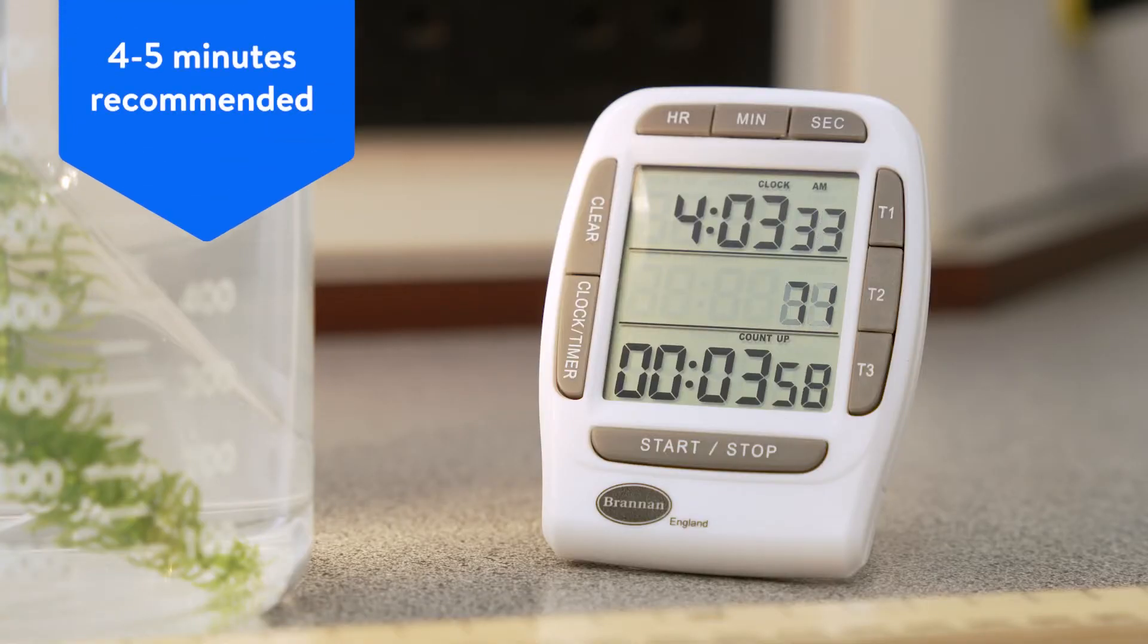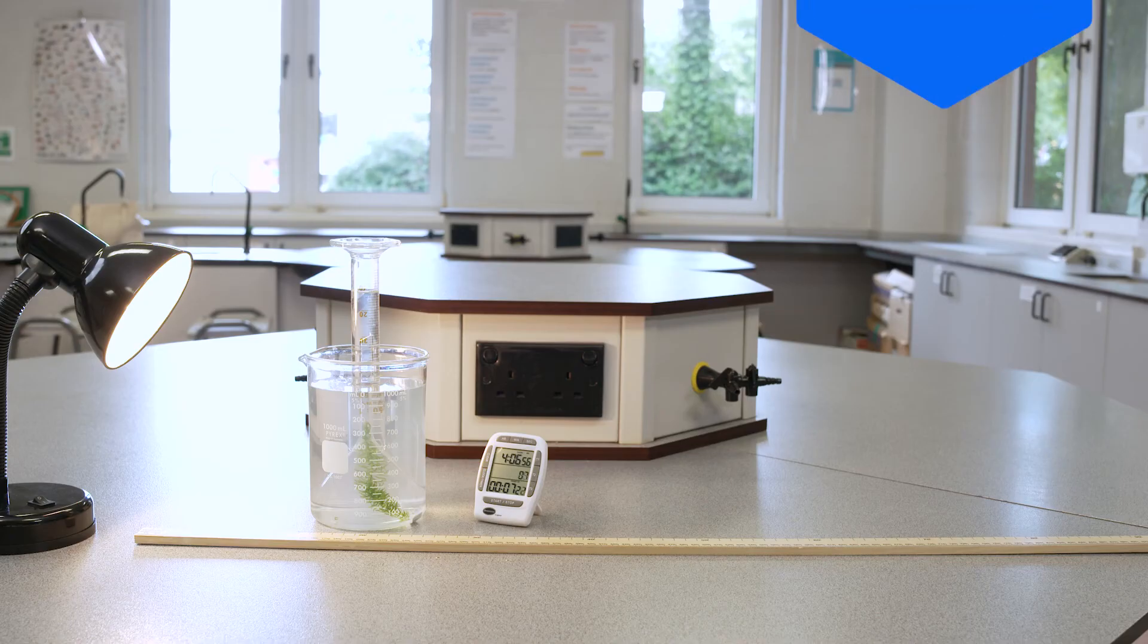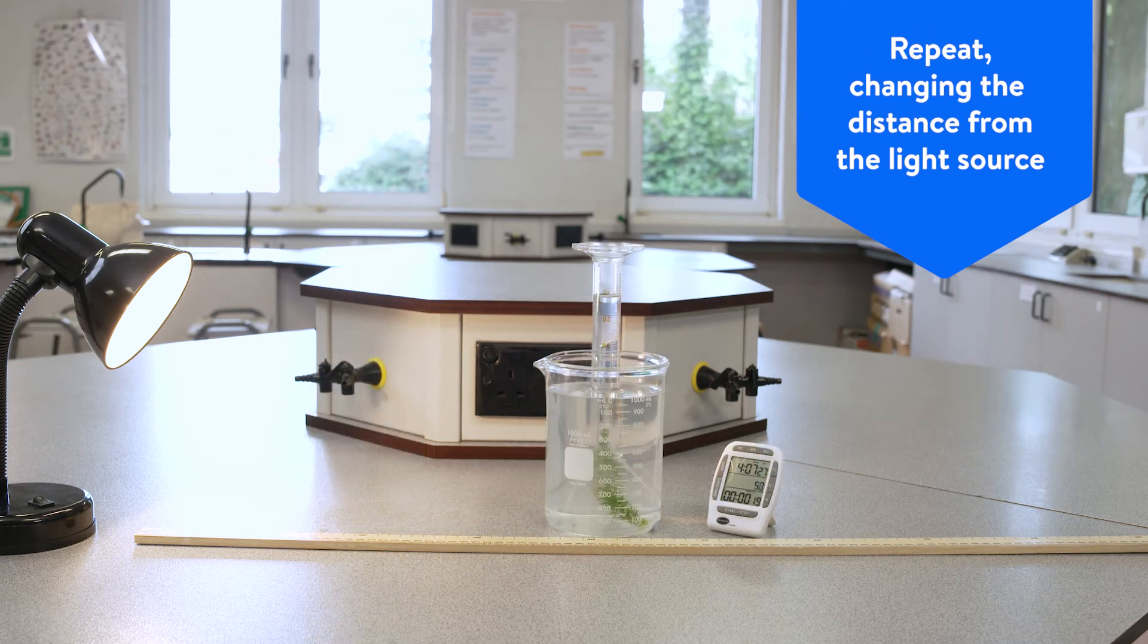Record your findings in a suitable table. Repeat this process changing the distance between the lamp and the beaker containing the pond weed.